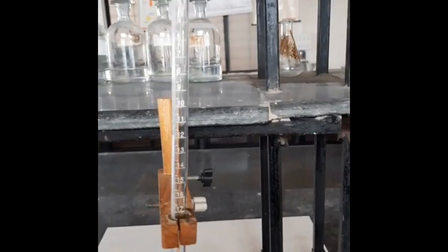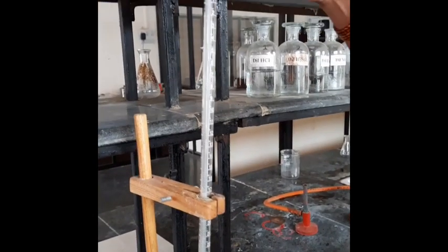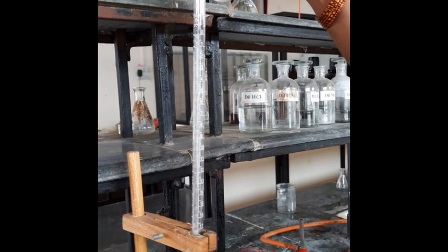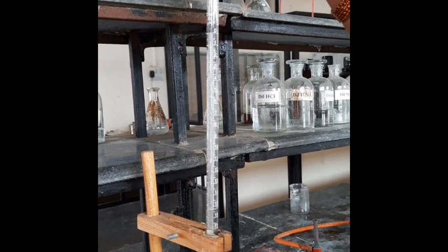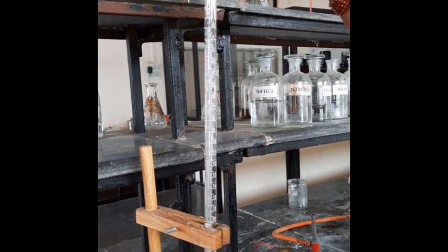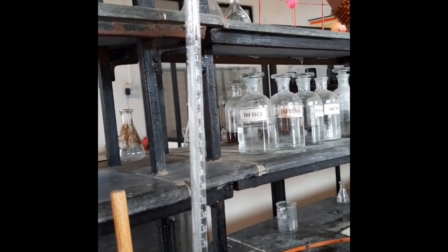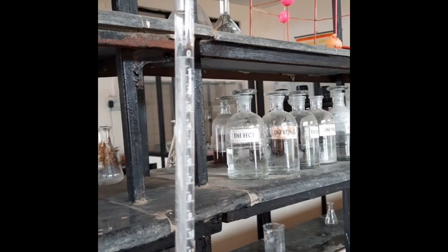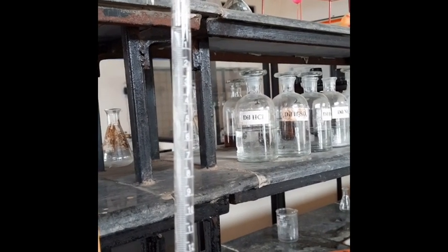Now fill the burette, which is clamped on the wooden stand, with sodium thiosulfate. You have to adjust up to the zero mark. Which solution are we taking in the burette? 0.1 normal sodium thiosulfate. The formula of sodium thiosulfate is Na2S2O3. Take a few more and then adjust to the zero. Now it is above the zero. Now adjust exactly to the zero. You can see here the solution is coming out. Up to the zero mark you have to adjust it.